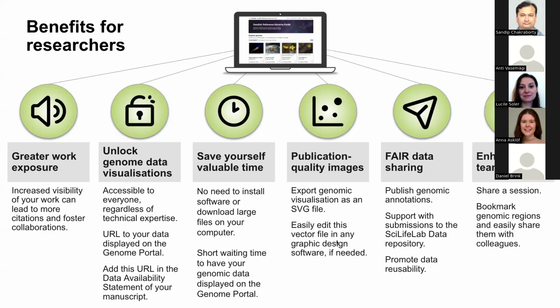And lastly, by using the Genome Portal, and in particular JBrowse, you can enhance your teamwork. There are different features that are very, very nice. For example, you can share a session, you can share a view, you can actually bookmark the specific genomic regions that you might be interested to look after and you want to discuss with your colleagues.